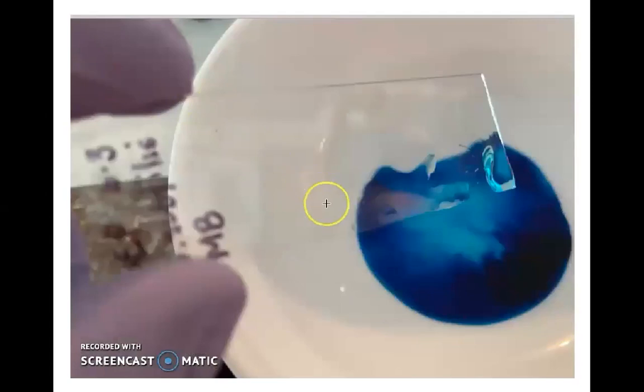Once that time is up, you get your stain waste container, like that bowl I showed you a minute ago. You're going to hold your slide over it, and you're just gently going to rinse the excess stain off of the slide. Now, notice you don't see a big blue area on my slide, even though it's been stained. You're not staining the slide, you're staining the cells on the slide, and you're not going to see where those cells are until you put that slide under the microscope. Once it's rinsed, you can allow the slide to dry.